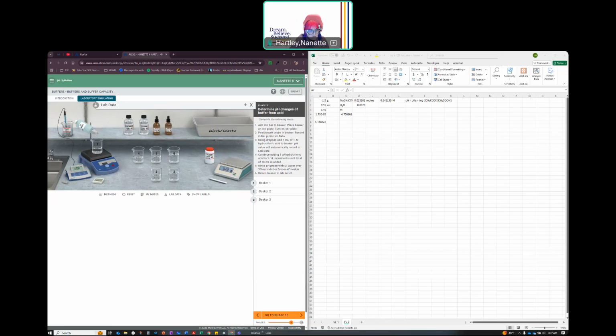Wait, it's off. Here too. Pick up bigger too. Yeah, we need this.